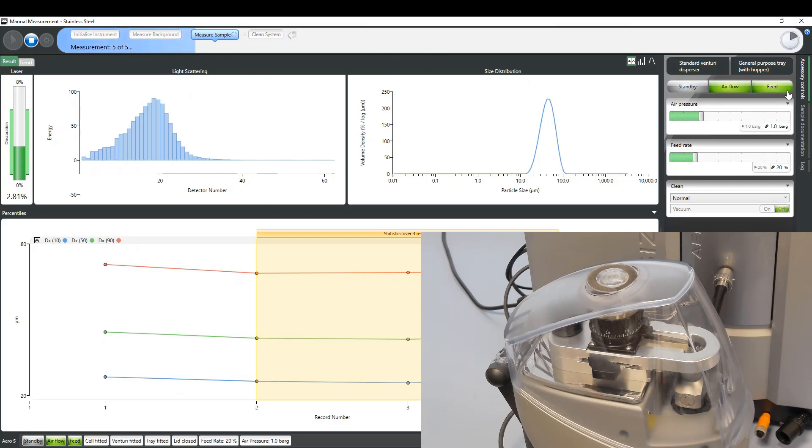Once the powder is depleted, or the final measurement in the sequence is performed, the active measurement will finish.